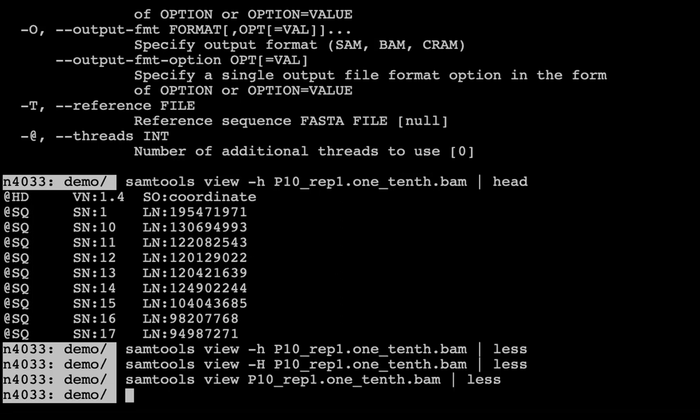But I'm not able to generate how the alignment and how. If I'm using the server, it is not Augment server. Augment server will install the whole thing. So I'm working on the server. So how do we hold this?